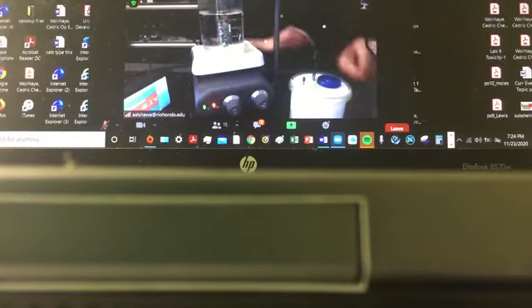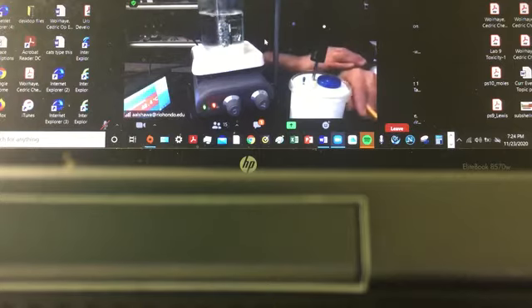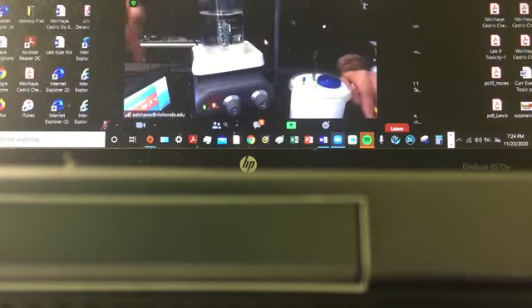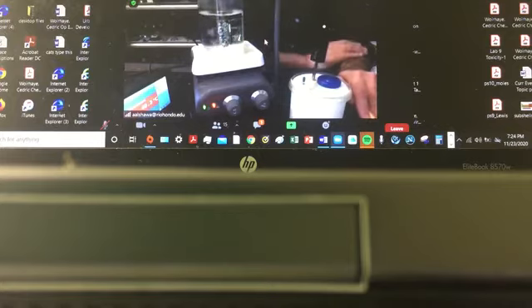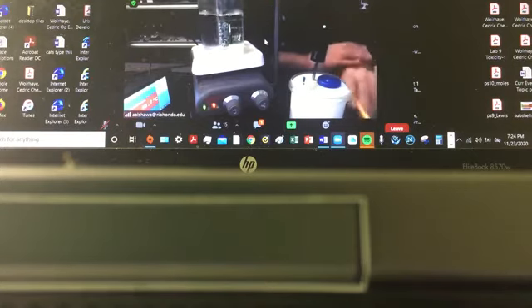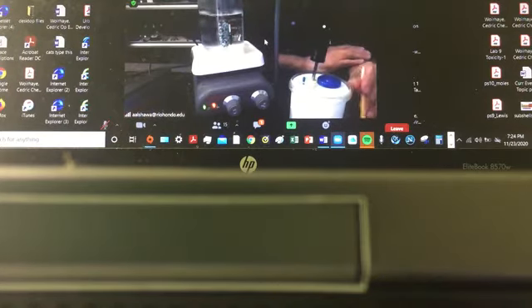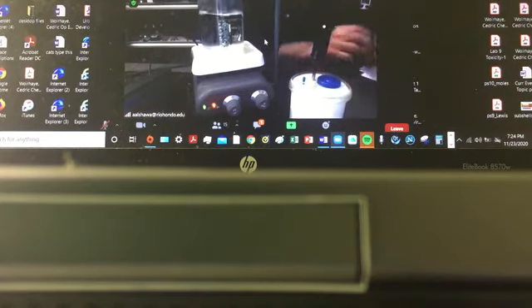So it's going to take a while. There's a combination of conduction and convection. Eventually, it's going to allow the temperature of the metal to rise. I'll give it a chance for 10 minutes. So let's time ourselves. Right now, 7:25. Let's see whatever that temperature is going to be, and we're going to transfer it after 10 minutes. There is no way for that temperature to achieve the same as the boiling temperature, although I presumed it would be 100, the temperature of that boiling water.